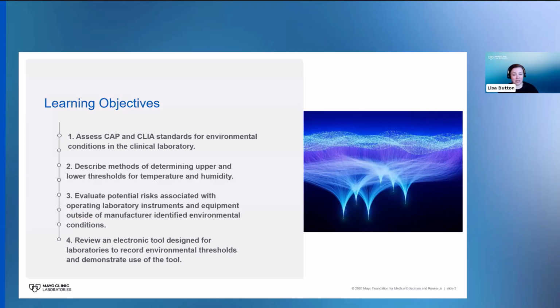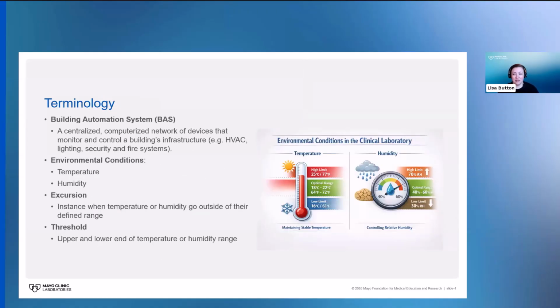And we'll review an electronic tool that was designed for laboratories to record environmental thresholds and demonstrate the use of that tool, how we're using it here. Before we get into the content of the presentation, I wanted to build a base level for all of us. So this is a terminology page, things that might sound familiar to you or maybe you've not heard before, but you will hear during the presentation so that we're all on the same page.